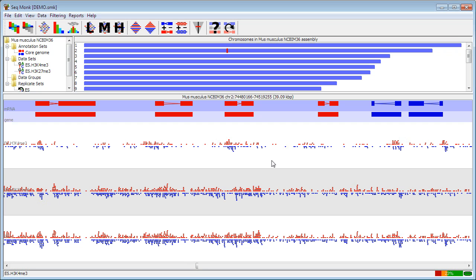Using these basic controls you should be able to go around your genes of interest or browse through your data to have a look at how your raw data sits.